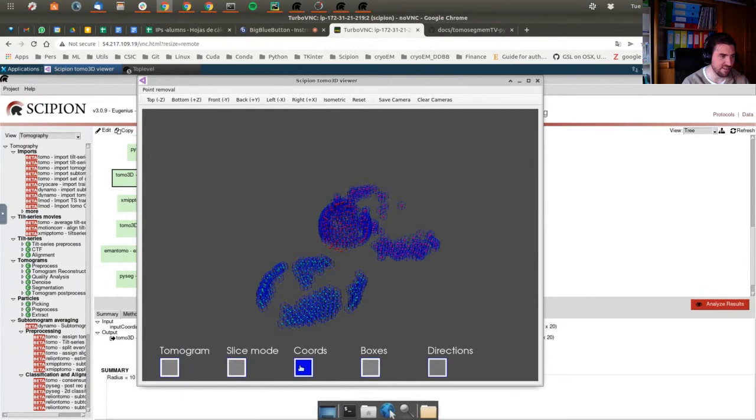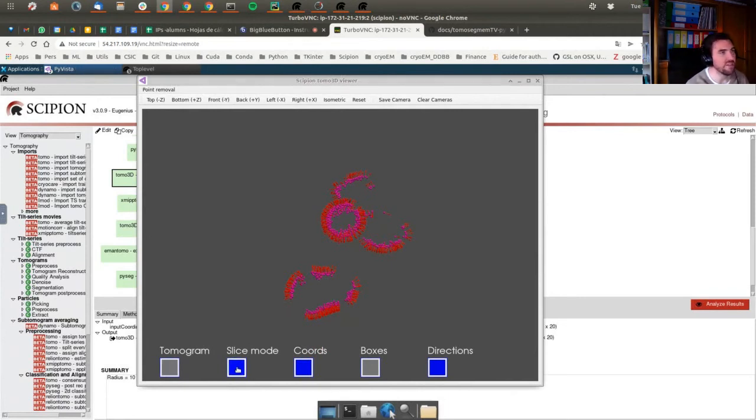Its memory is full with all of this information. Okay, so here with these colors, you can represent the directions, again as shown in the documentation. I was expecting to have the vesicles, but I don't get them. Maybe it's another version of the software, the one I have.